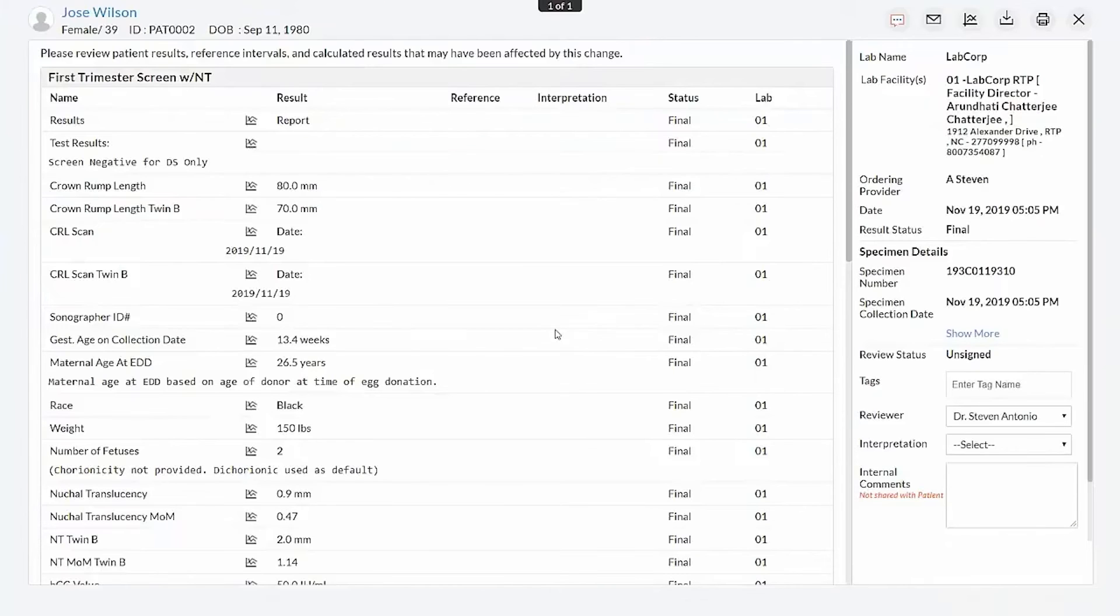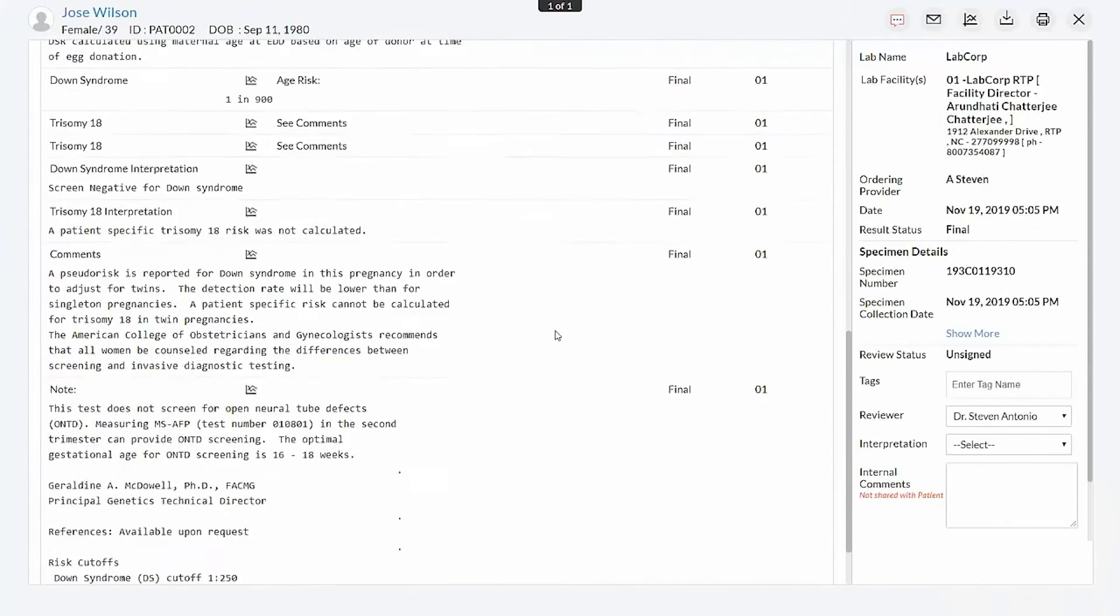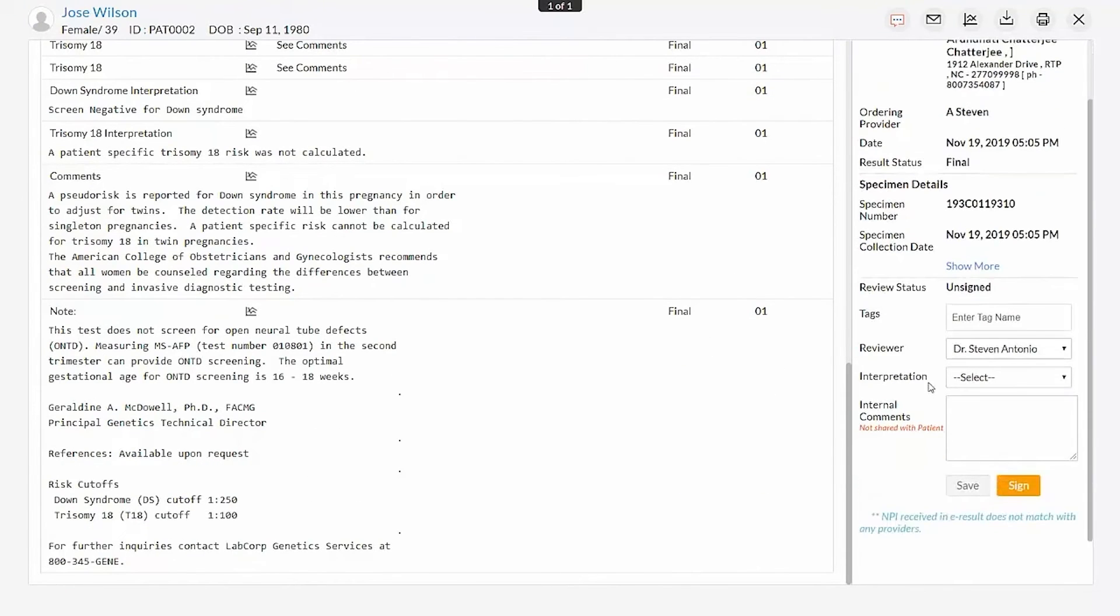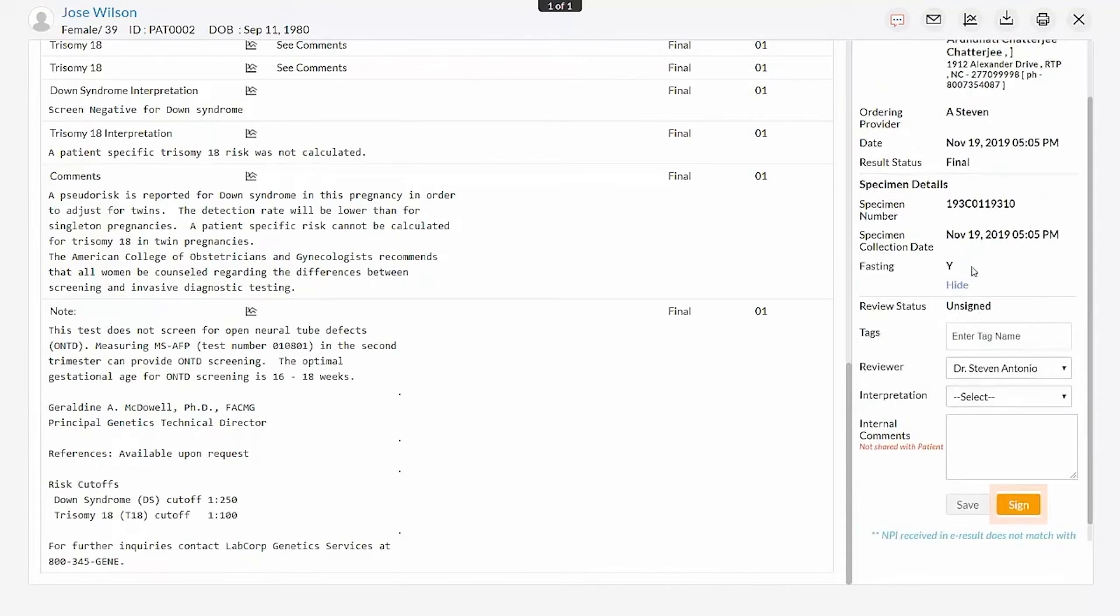Result details received from LabCorp will be displayed in the Review section. If the reviewed result contains the fasting details, then it can be viewed by clicking the Show More option. After review, the report can be signed using the Sign button.